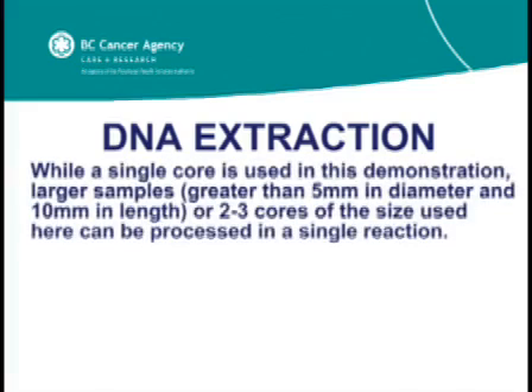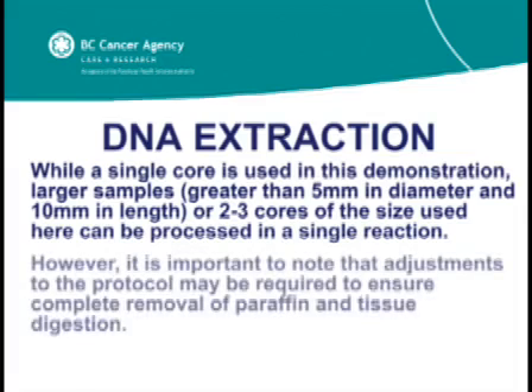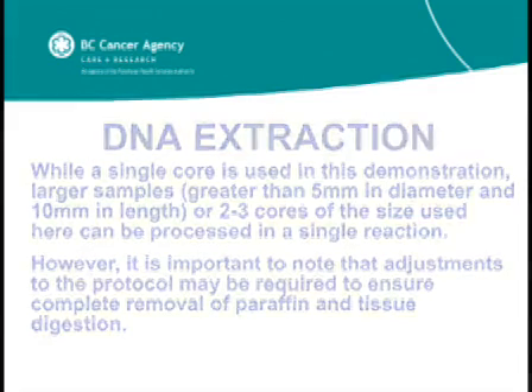While a single core is used in this demonstration, larger samples greater than 5 mm in diameter and 10 mm in length, or 2 to 3 cores of the size used here, can be processed in a single reaction. However, it is important to note that adjustments to the protocol may be required to ensure complete removal of paraffin and tissue digestion.